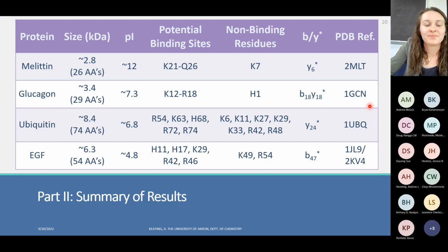I may have missed the reason why, but why do you use the PSS tetramer specifically? Why not 5 or 6 or 3? Oh, yeah. So actually, I think it was EGF formed with a hexamer. These three, it was just about the ion, like the tag that we were able to see.